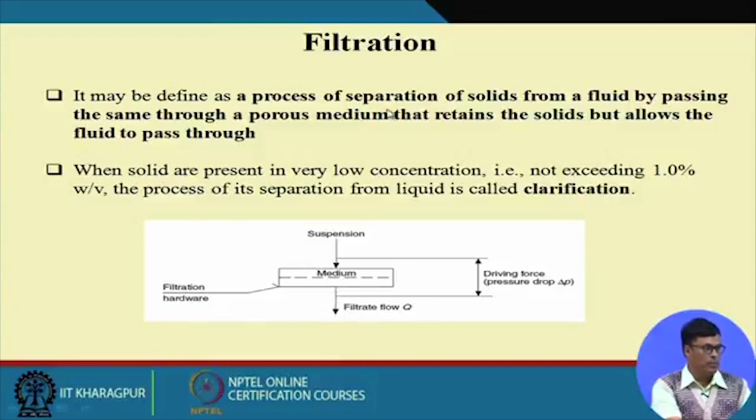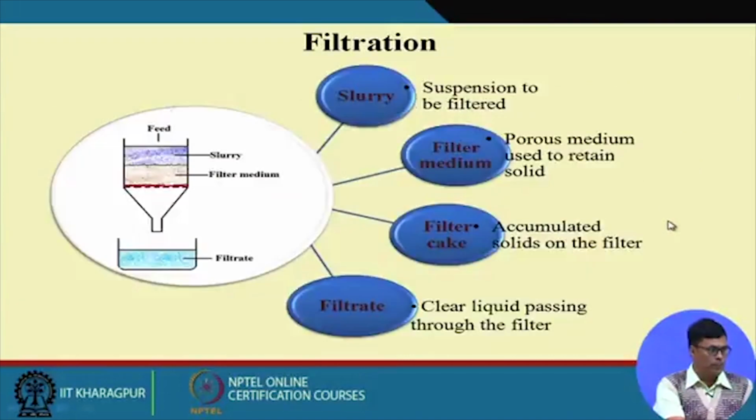Filtration may be defined as the process of separation of solid from a fluid by passing the same through a porous media that retains the solid but allows the fluid to pass through. When solids are present in very low concentration, not exceeding 1% weight by volume, the process of their separation from the liquid is called clarification. So clarification also means the separation of solid from the liquid.